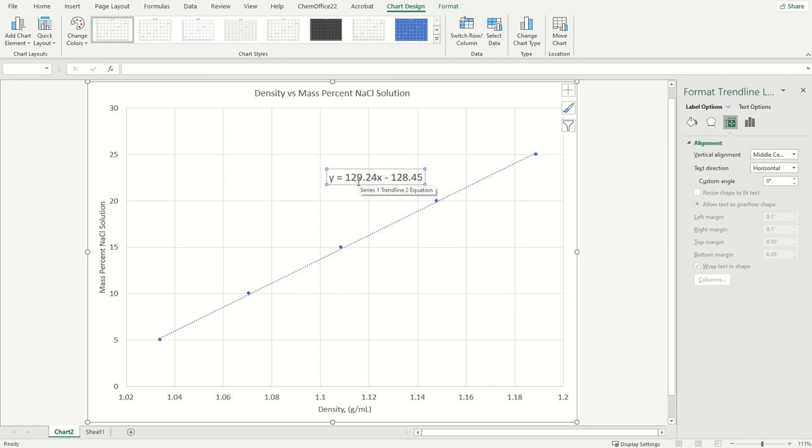Change the font on that so we can see it a little bit better. So here's my equation. Y, the mass percent, is equal to 129.24x minus 128.45.